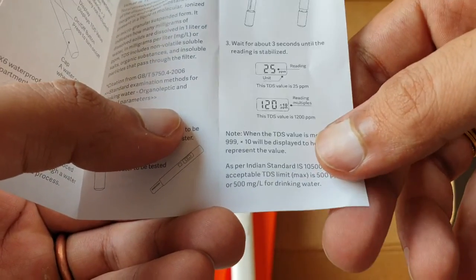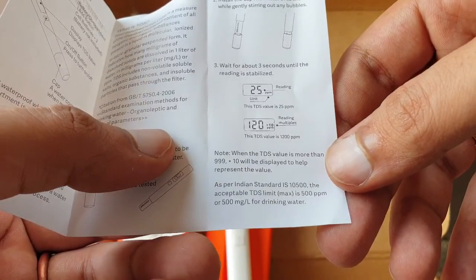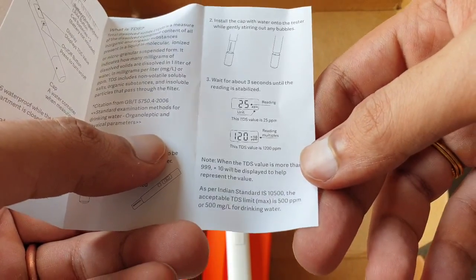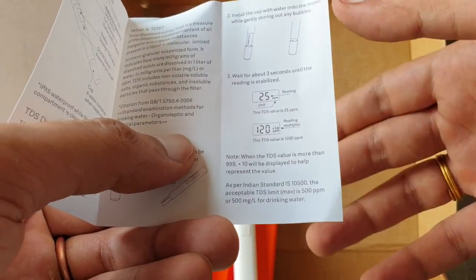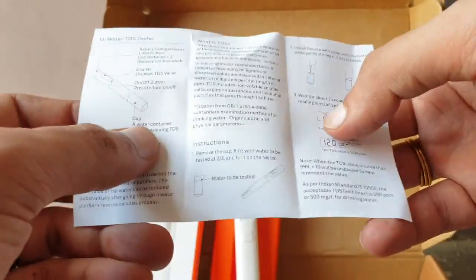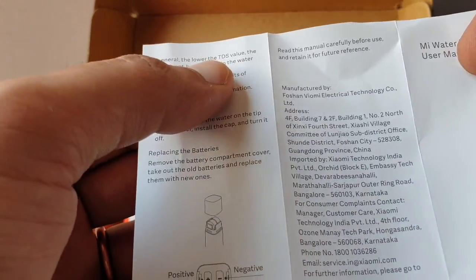You should not consume water with TDS below 100 either. They say the lower the TDS, the purer the water appears, but it can be more dangerous — very low TDS water can dissolve plastic and cause serious health problems. If TDS reaches zero, it becomes like distilled water, which is used in inverter batteries for power backup.